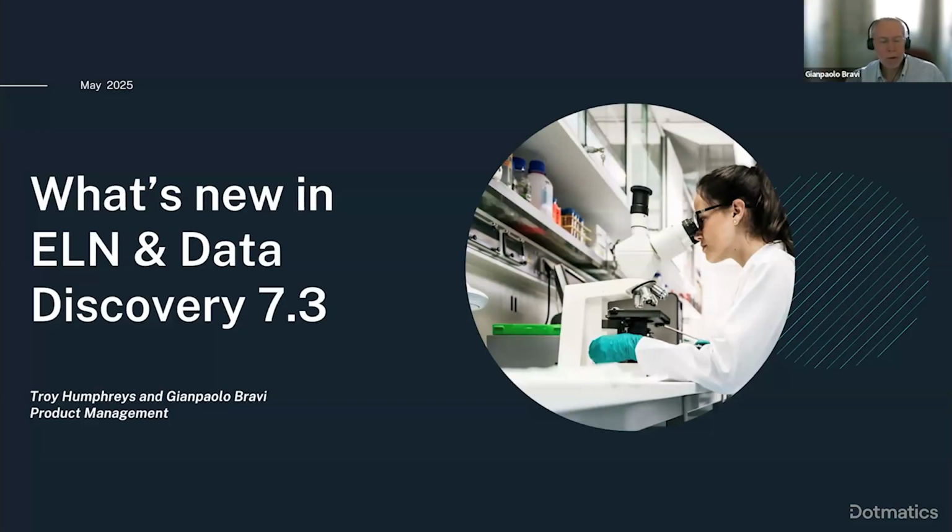My name is Gianpaolo, and I'm here with Troy to take you through what is new in ELN and Data Discovery for release 7.3. Troy and I are product owners of ELN and Data Discovery. Our presentation should last 40-45 minutes, and we'll have some time at the end for Q&A.